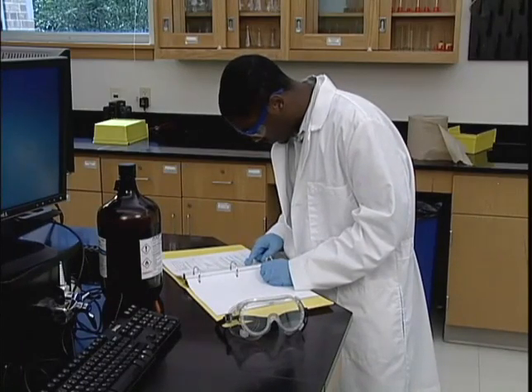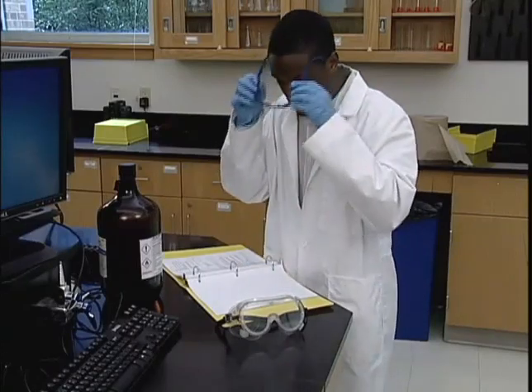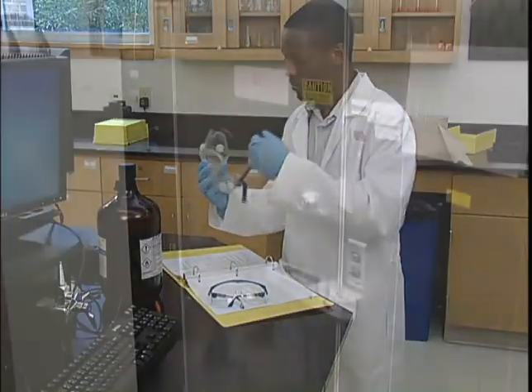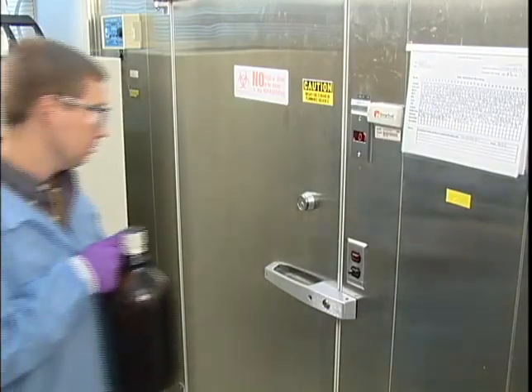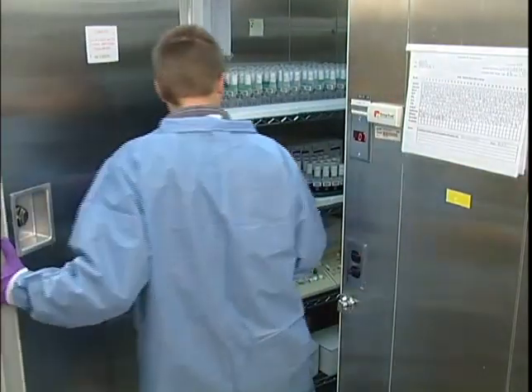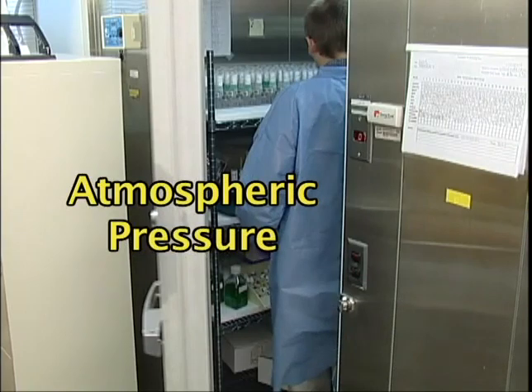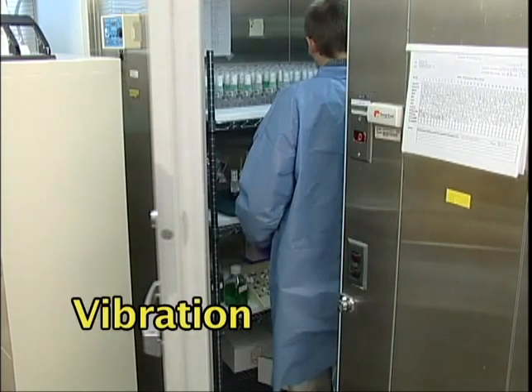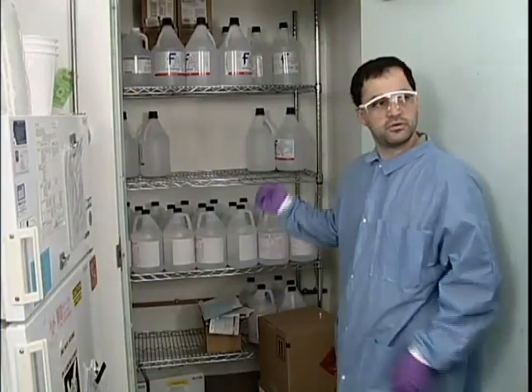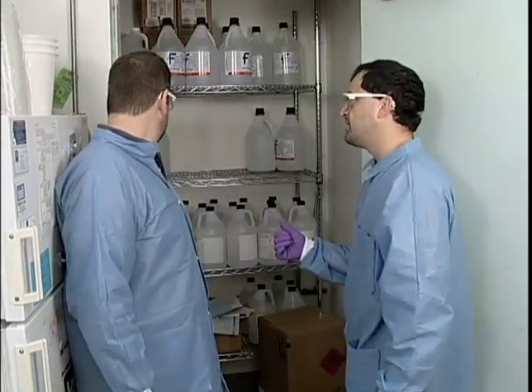For example, in this section you might see the caution, avoid contact with eyes, skin, and clothing. Ensure that containers are properly secured before moving. This section also provides information on the appropriate storage conditions for the material and its container, including temperature, humidity, atmospheric pressure, ventilation, vibration in the area, and exposure to light. Depending on the material, these may all be relevant factors for safe storage and maintaining product quality.